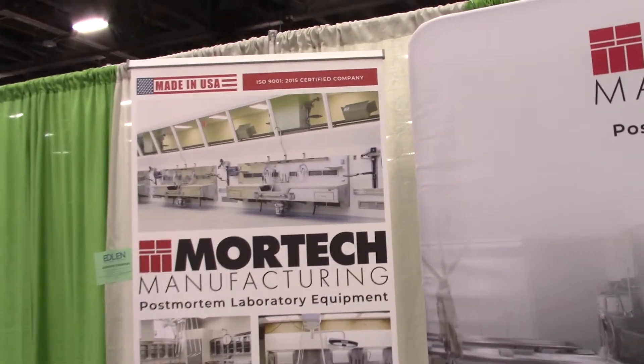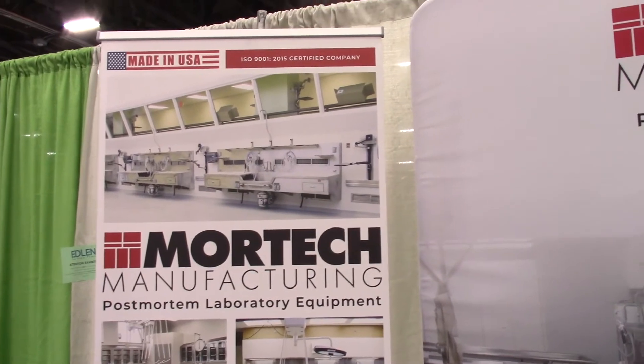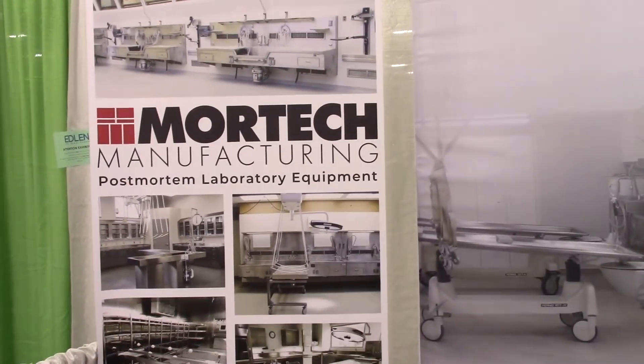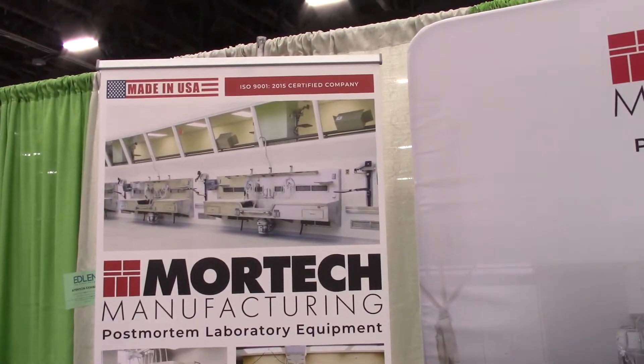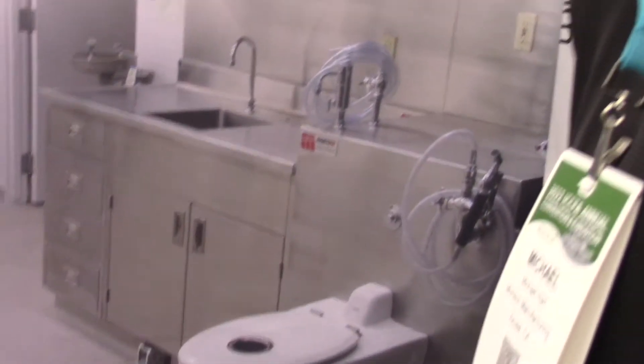Hello, I'm Mike Hart with Mortech Manufacturing. We manufacture post-mortem laboratory equipment. So I'm looking at what looks like sinks — those are wall mount autopsy sink stations and autopsy tables, embalming stations, storage racks, cold rooms.